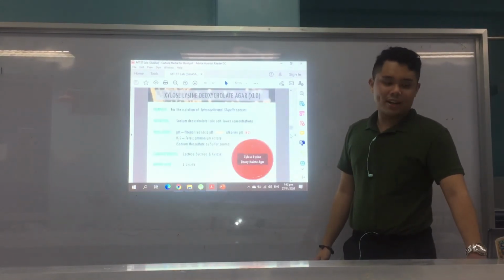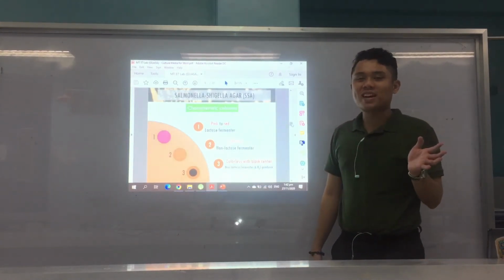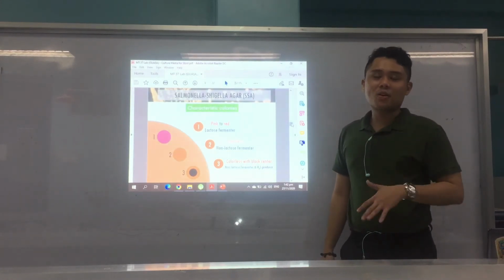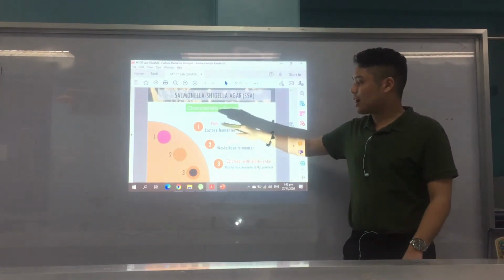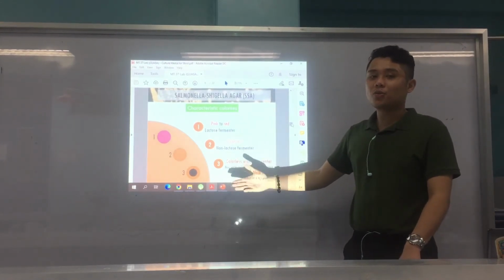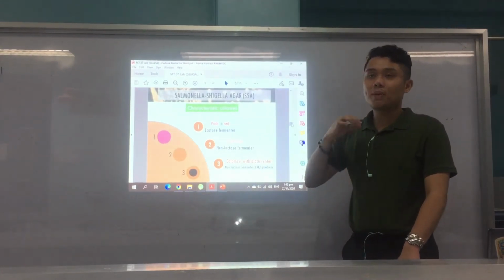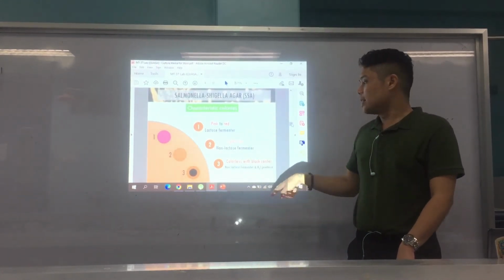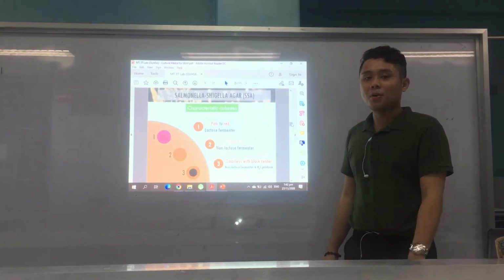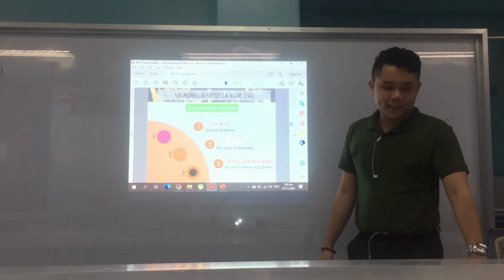Pink to red lactose fermenters are other members of the Enterobacteriaceae, like E. coli and other organisms. So what we are looking for are number 2 and number 3. Colorless, non-lactose fermenter that does not produce H2S is characteristic of Shigella. And number 3, colorless, non-lactose fermenter that produces H2S, so with a black center, that could be Salmonella, because again, Salmonella produces H2S. Okay, so that's for Salmonella Shigella agar.